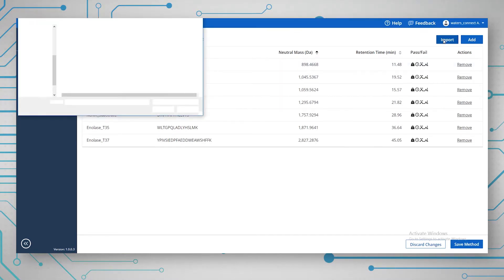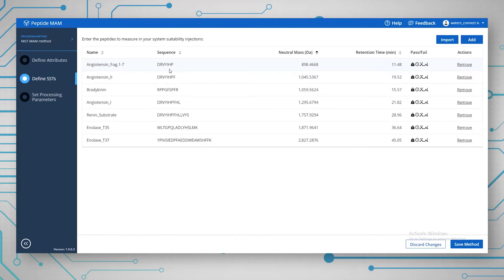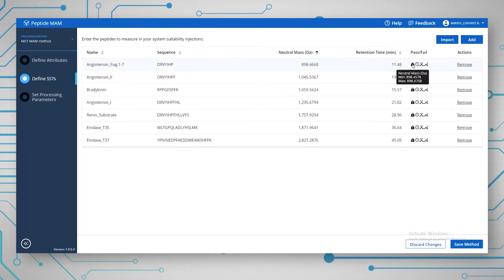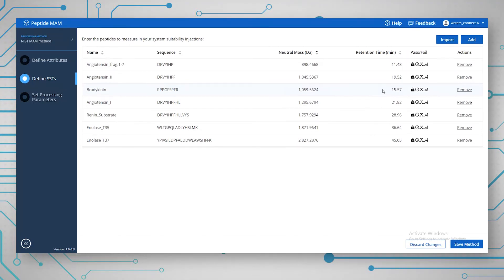We import a CSV file with all this information — basically just what we want to monitor for the system suitability test. It's a list of seven peptides from a mass prep mix. You put in the mass, the retention time, and the pass-fail criteria. For example, you specify the mass error tolerance, retention time tolerance, and also peak width and intensity min and max values. This allows you to have a quick pass-fail assessment on these samples, making it really easy to see if anything is going wrong with the instrument through the run.